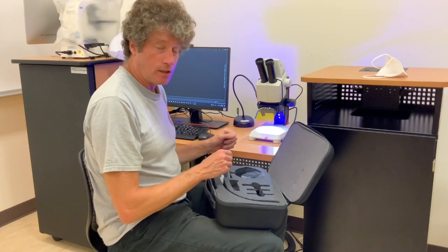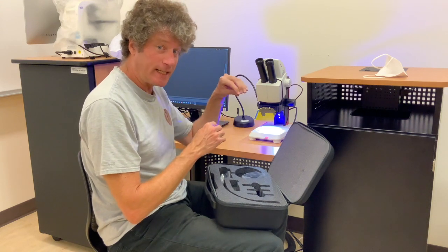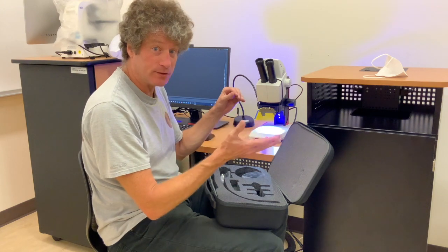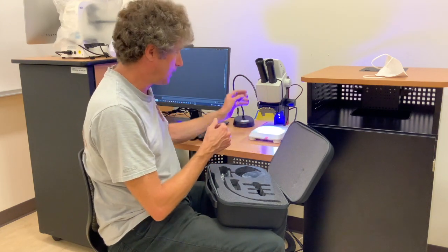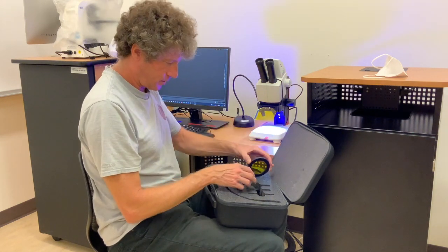Now you have your band pass filter — blue light excitation — and then emission will be green, yellows, and reds, and you can see that in here. So you can test your samples for fluorescence. And then when you don't want fluorescence, take it off and put it back here.